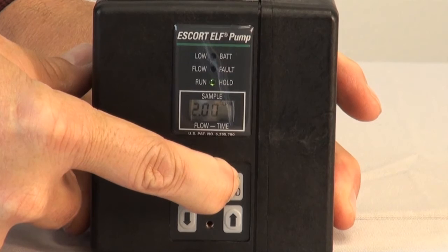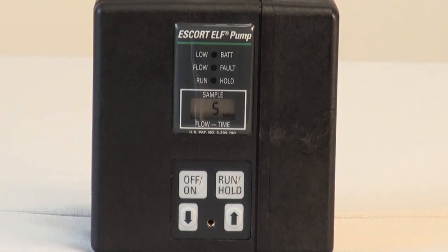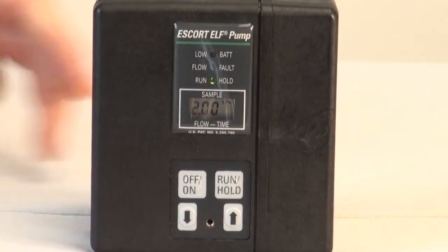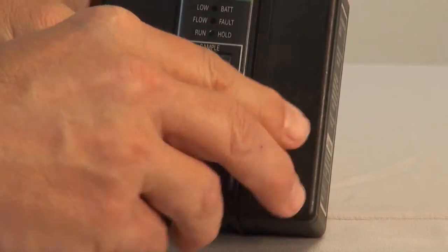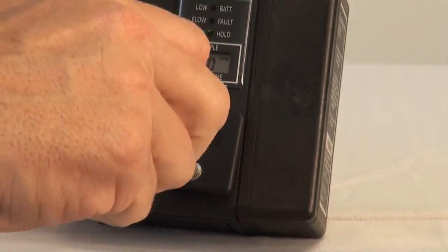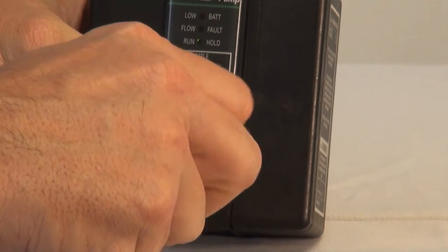If it is necessary to stop your sampling for a short period of time, you can simply press the run-hold button. The pump will stop and the run-hold LED light will begin to flash. To restart the sampling, press the run-hold button again. After the pump is set and running, replace the switch cover. This will keep the control pad protected from being accidentally shut off or the flow rate changed during the sampling period.